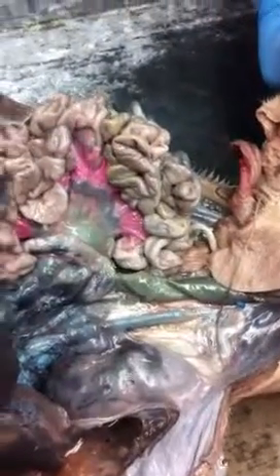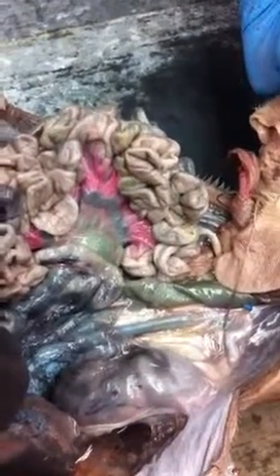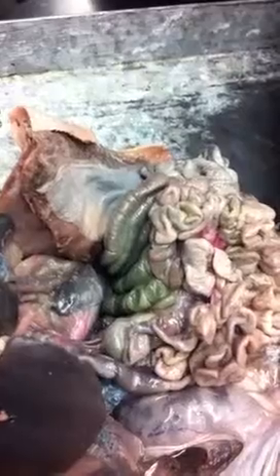So let's see. We're starting from the bottom, right? So inferior mesenteric we crossed off. We crossed the superior too. We haven't crossed it off officially yet. Gastric. No, we're not going to be able to find the gastric vein. We can find gastric arteries, but not gastric veins, because we need a triple injection for that. So gastric vein we can cross off. Stomach we know, liver we know, hepatic portal we found. Hepatic we found. Posterior vena cava, we found that, right? It was up posterior here, right here. Right there. Yeah. This portal.